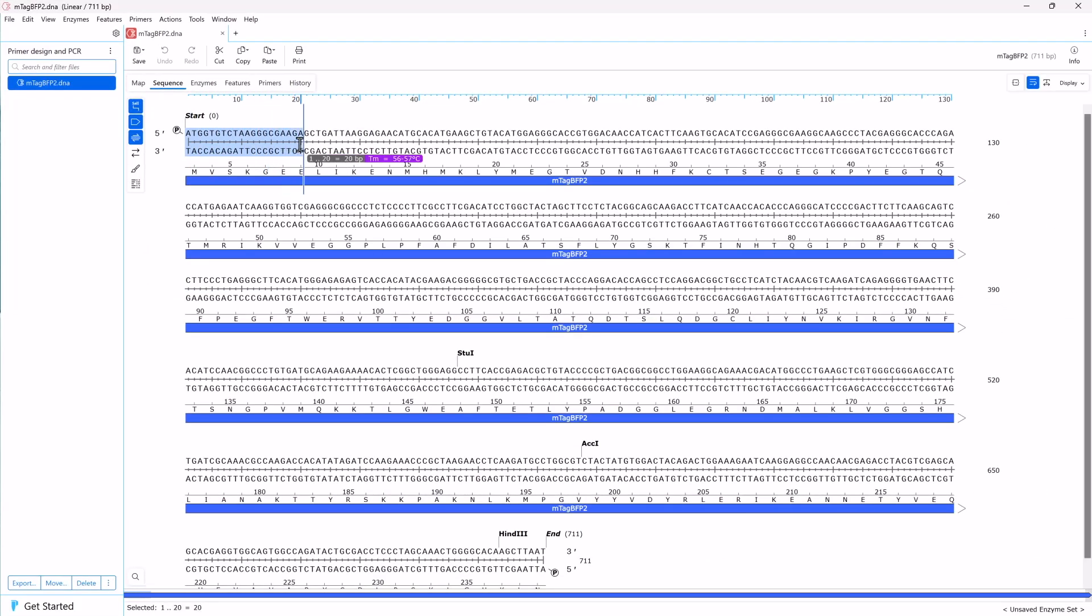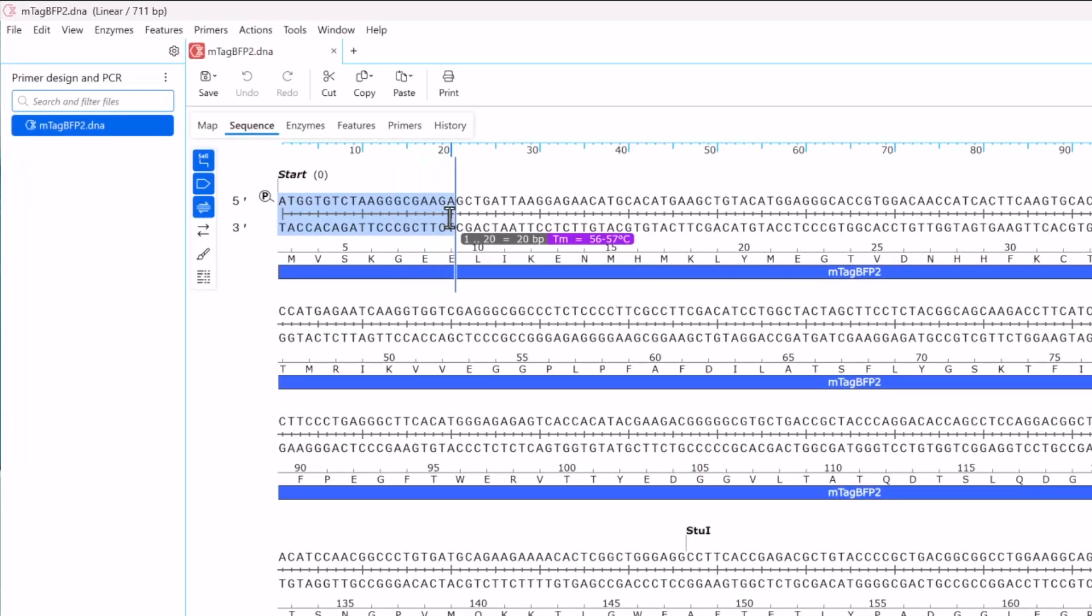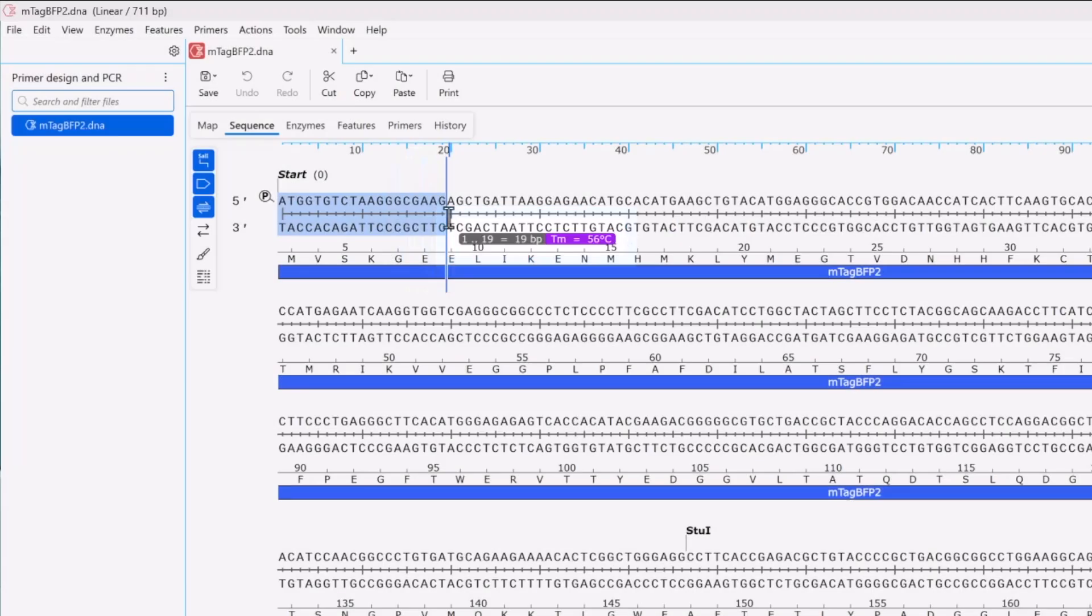Now you can define the forward primer's initial binding region at the coding sequence's start. In this example, you want the binding region of your primers to have a melting temperature of around 55 degrees Celsius. Click and drag to display the predicted Tm for the selection. For example, selecting 19 nucleotides gives a melting temperature of 56 degrees.